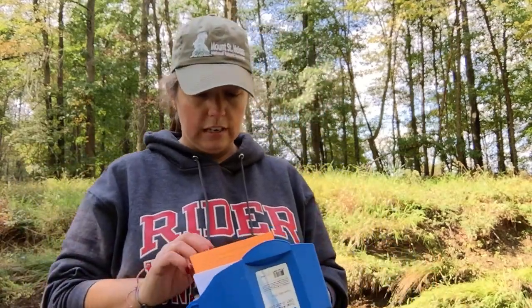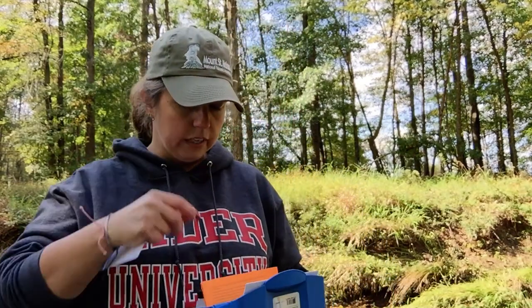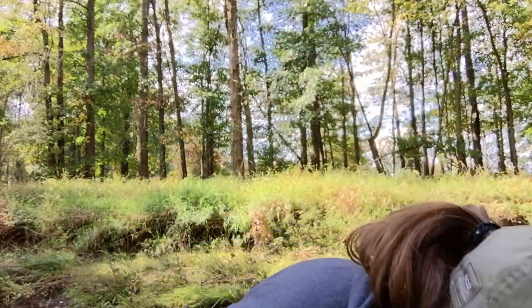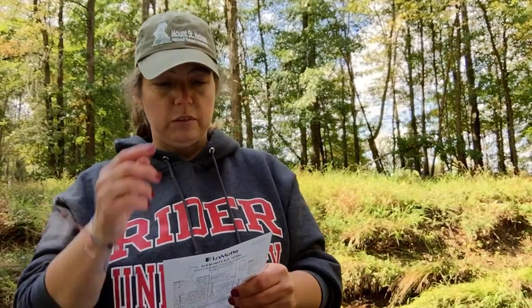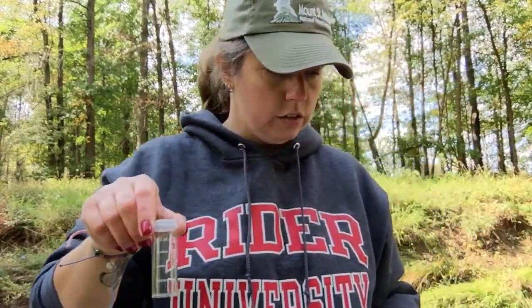The next test we're going to do is alkalinity - the kit even has a picture of the titrator on it. My directions tell me to fill the titration tube, one of those little glass tubes, with five milliliters of sample water.